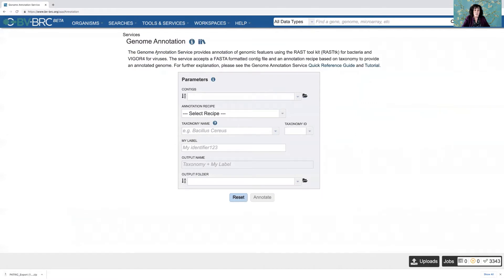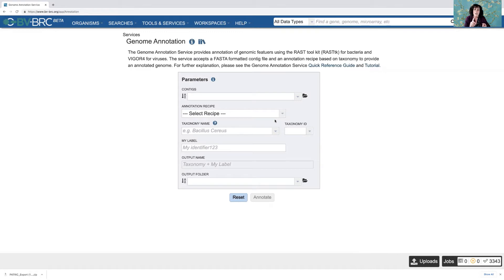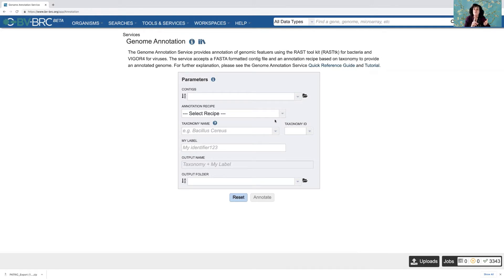So this is a job landing page that you see in BVBRC. Basically there are just a few things that you have to do from any of the services, not just annotation. You would have to identify the data that you want to use, select some parameters, name the job, and assign an output folder for the completed job to be stored in.